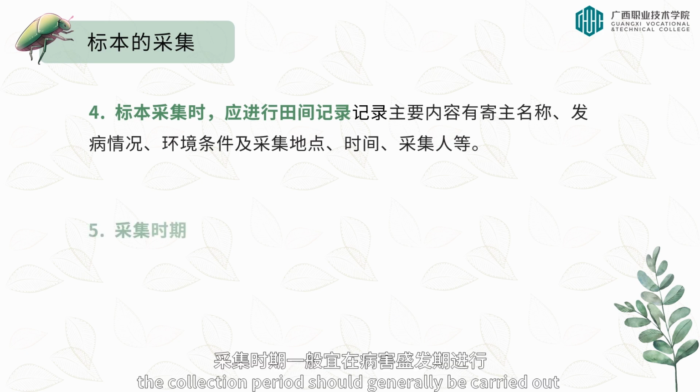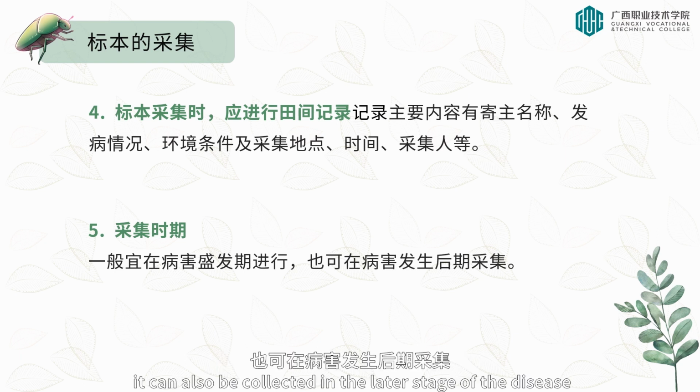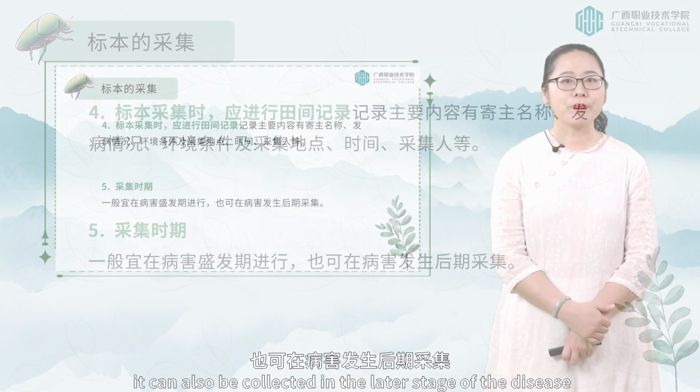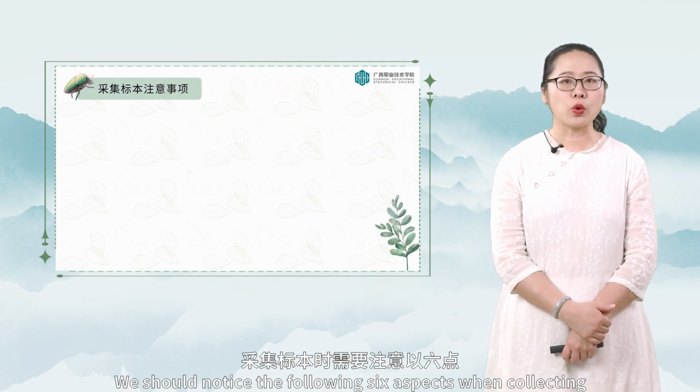The collection period should be generally carried out in the epidemic period of the disease. It can also be collected in the later stage of the disease. We should notice the following 6 aspects when collecting.